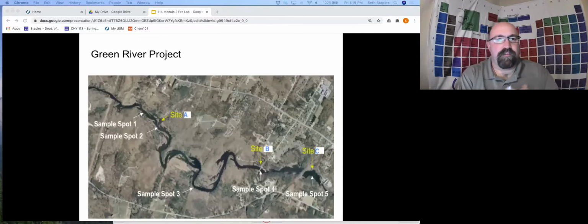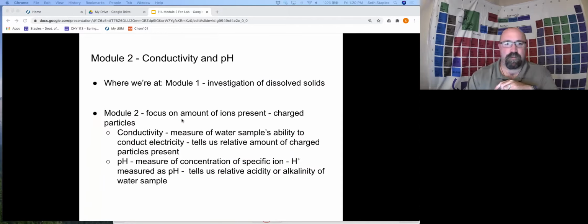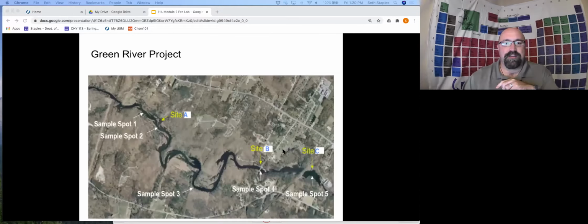Hello, this is our pre-lab discussion for Module 2 in CHY 114. Today we are continuing our investigation of the Green River and trying to determine whether possibly the housing development at Site A or the textile mill at Site B is contributing to some of our algae growth and fish kill down here at Site C.